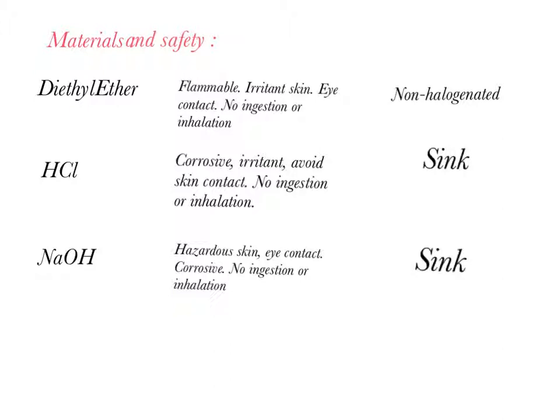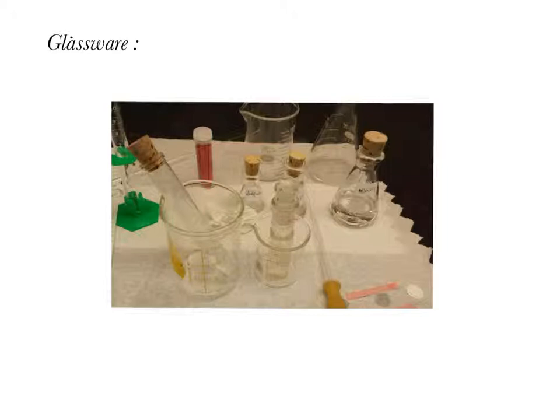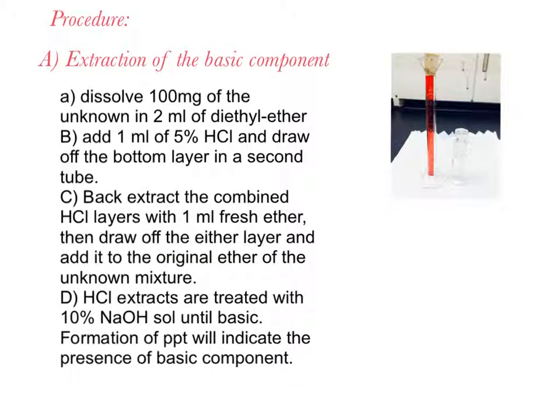Sodium hydroxide is hazardous to skin, so avoid eye contact, and it's extremely corrosive, so no ingestion or inhalation. For disposal, it goes down the sink. For glassware, first, extraction of the basic component.